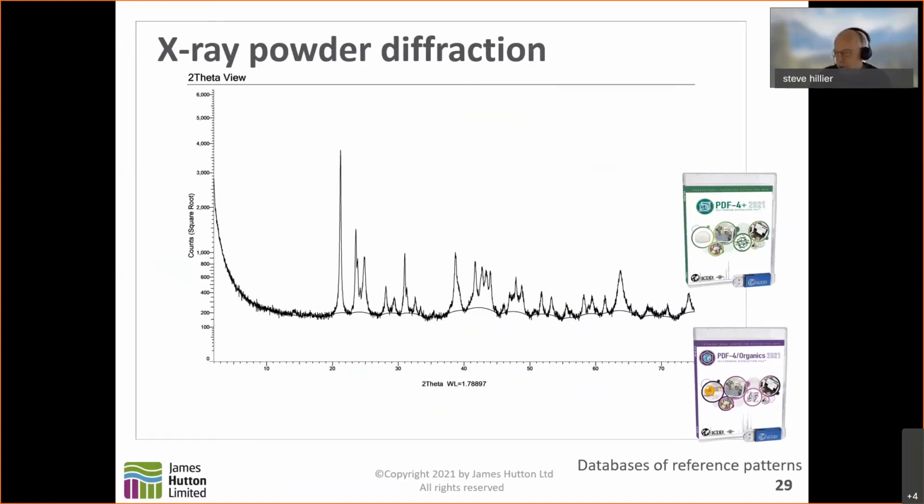And keep in mind that most of the samples we receive are mixtures of different compounds, and the diffraction pattern that we obtain is then a sum of the component patterns of the individual components. So the process of identification here typically involves matching patterns from databases or monographs or based on experience with the observed pattern.